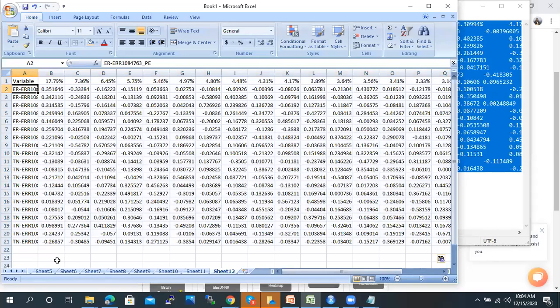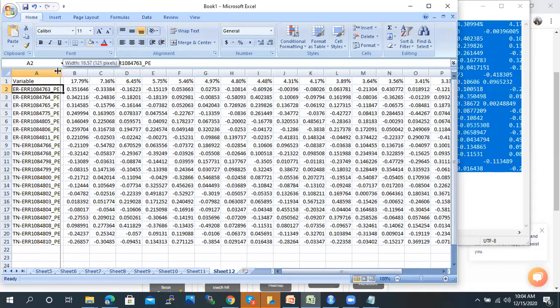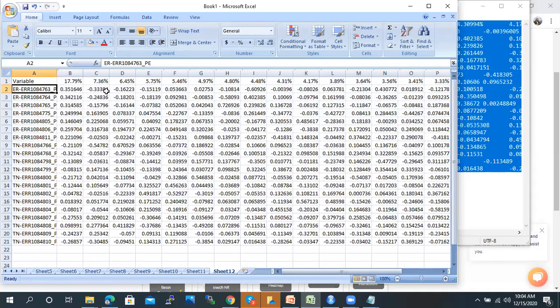The other output is the quantile normalized one. Right now I'm taking this PCA because we have done the normalization last time, so right now I'm skipping that. You can compare non-normalized data with the quantile normalized data as well. Here, these percentages represent each of these components. This would be the first PC component, then this is the PC2 component, PC3.